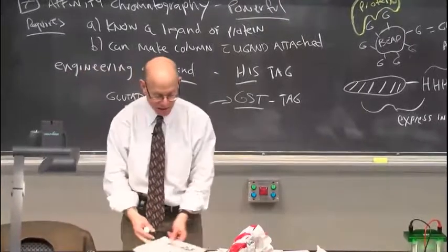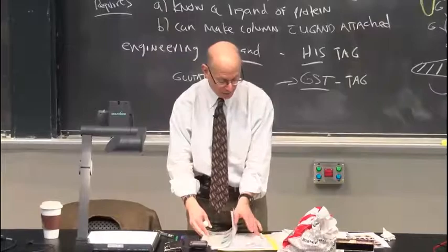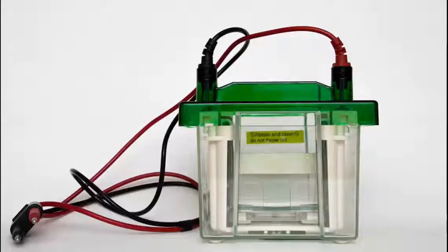I can follow this as I purify it by doing two things. I can measure the specific activity. We're going to talk about that the next time. Or I could watch this by electrophoresis. So we run gel electrophoresis in a device like this. I will bring it with me the next time, and we will go through a little bit of the science behind it.